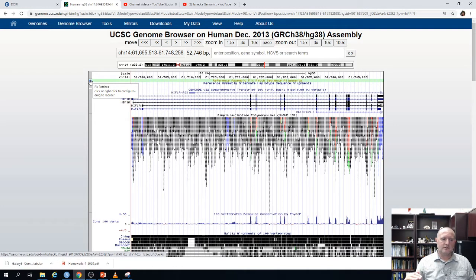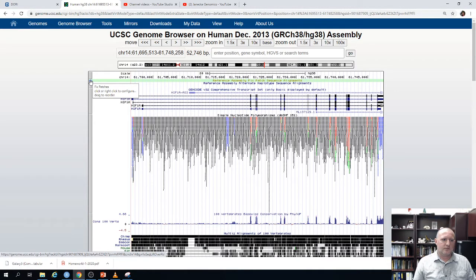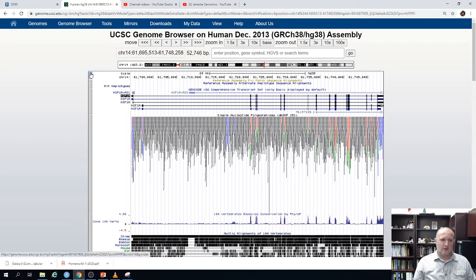If you highlight a track on the left — that little rectangle — it turns green, and you can see what specific track is at that position. If you hover your mouse over it, it tells you what dataset is in that track. For example, hovering over one says 'fixed patches' — basically just an update to an assembly, nothing to worry about. The very top row shows the coordinates of that chromosome: chromosome 14 and the base pair positions you're looking at.